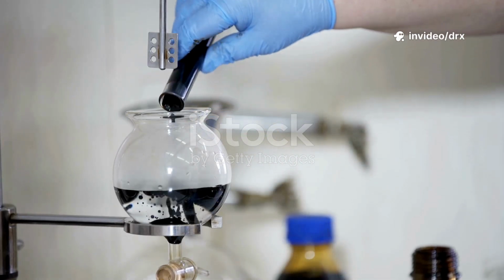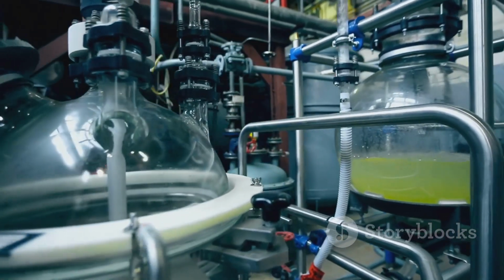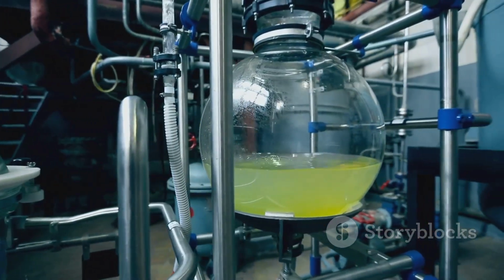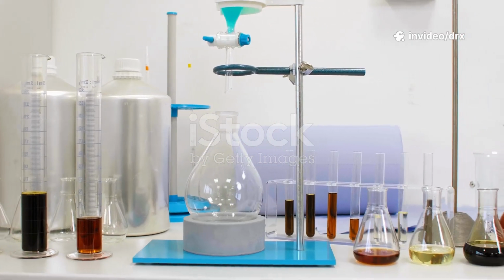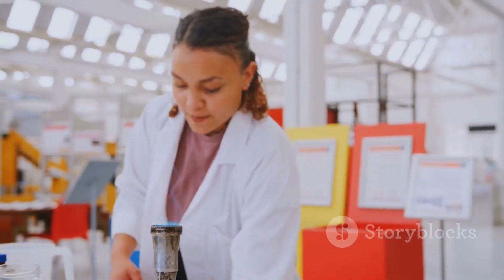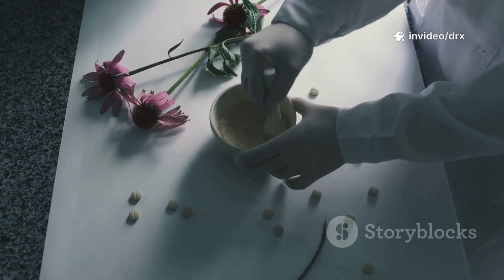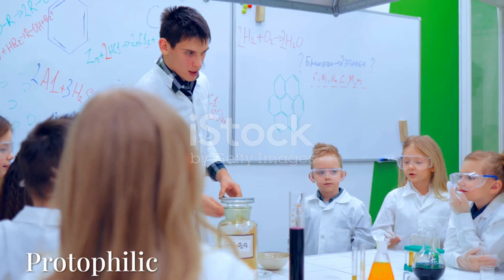Non-aqueous titration is a type of titration carried out in organic solvents instead of water. It's used especially to determine the potency of weakly acidic or weakly basic drugs. The principle is based on the acid-base reaction in a suitable non-aqueous solvent. Non-aqueous solvents increase the strength of weak acids or bases, and they improve the solubility of poorly soluble drugs. This, in turn, results in sharp endpoints and more accurate titrations.